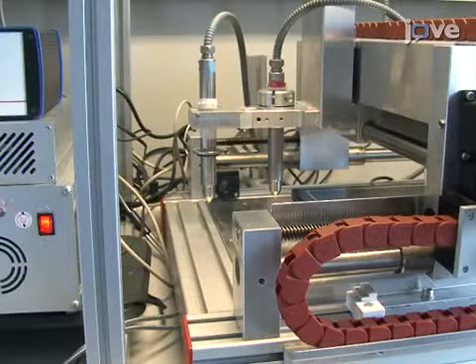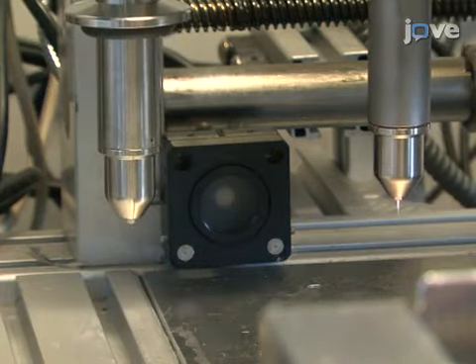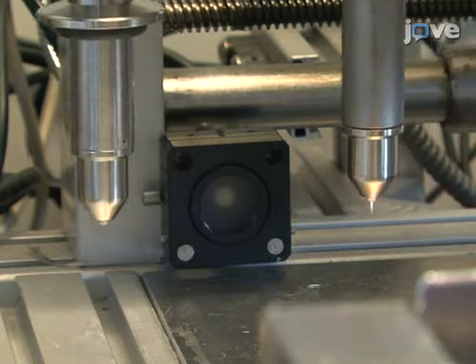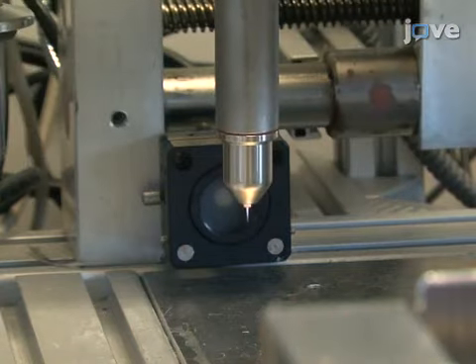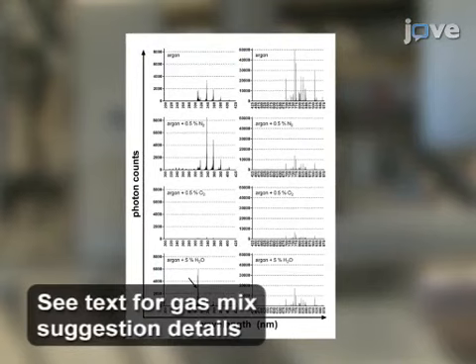For plasma species monitoring, position an atmospheric plasma jet in front of an optical emission spectrophotometer perpendicular to the plume axis, and use the dedicated software to record the photo emission and wavelength of each gas condition at 2 standard liters per minute feed gas flux.